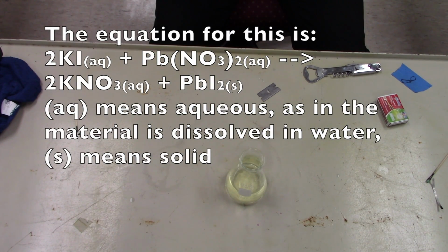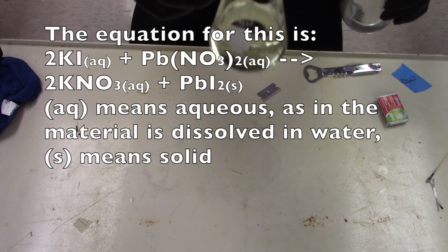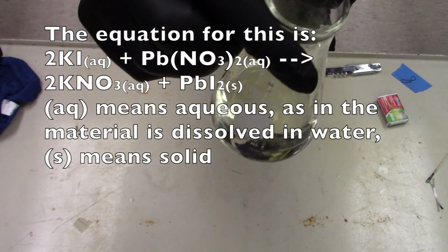I'm gonna mix two liquids together. One compound will still be liquid, the other will be a solid. Why don't I just hold it up here and I'll do it. Make sure it's in the frame of the camera. Okay, ready?